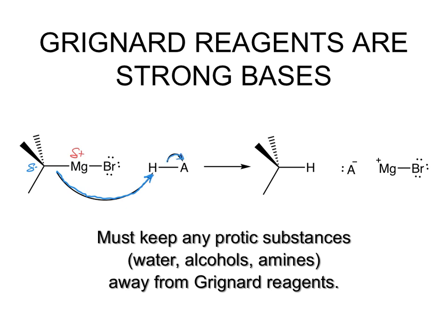And when they take that hydrogen ion, then we say that our Grignard is quenched, right? Because we just turn that back into a simple carbon-hydrogen bond, which we know is not polar and unreactive. And so the problem with that is it creates an unreactive product, which is not what we want to do usually.